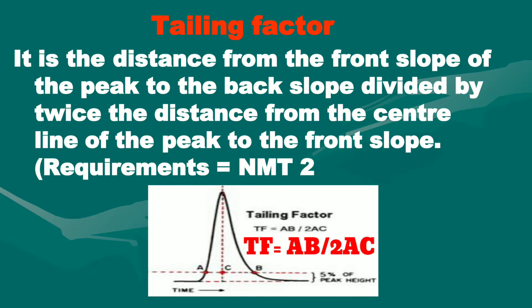Next is tailing factor. It is the distance from the front slope of the peak to the back slope, divided by twice the distance from the center line of the peak to the front slope. The tailing factor should be not more than two. In this figure, you can easily understand how to calculate the tailing factor of any peak in a chromatogram in HPLC.